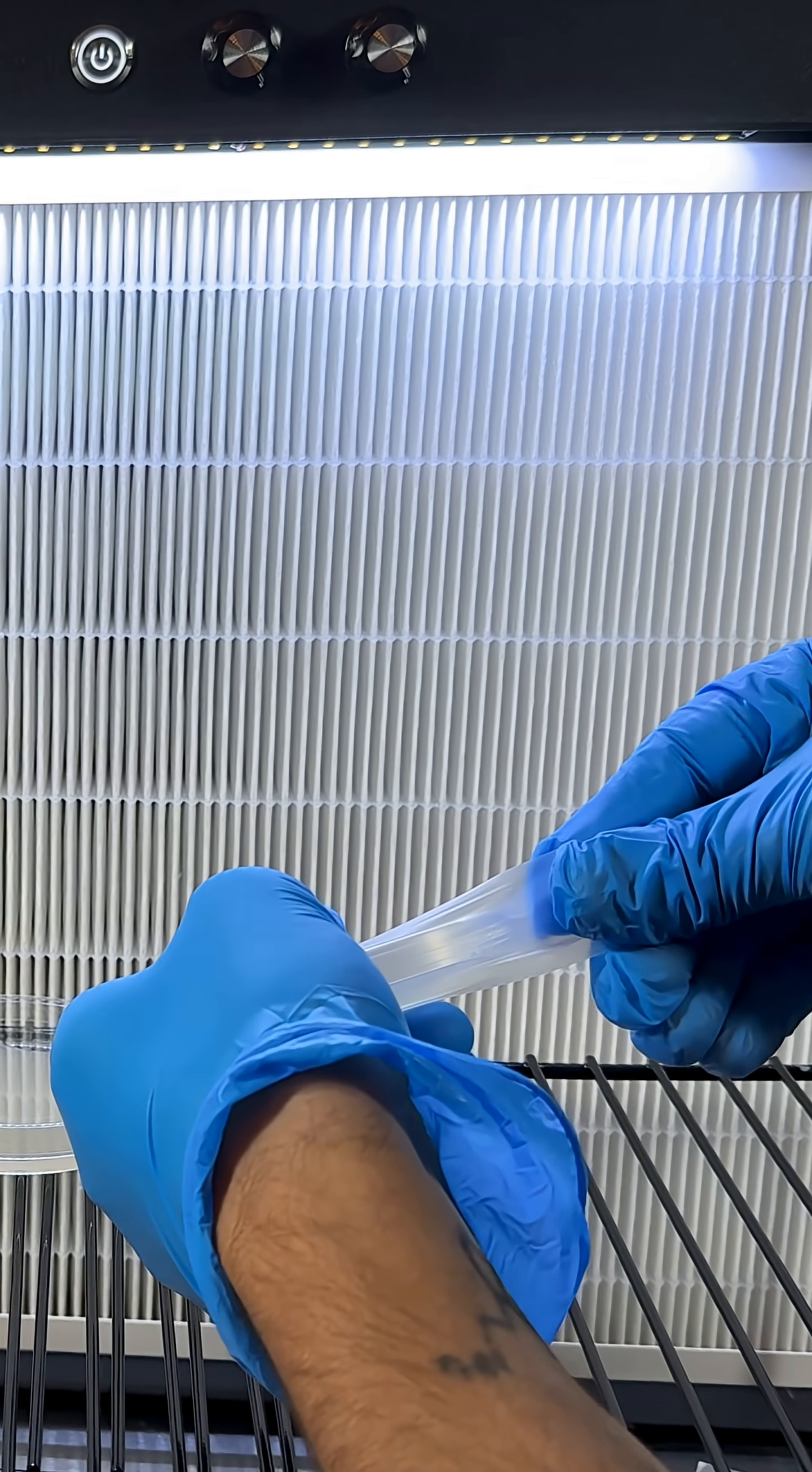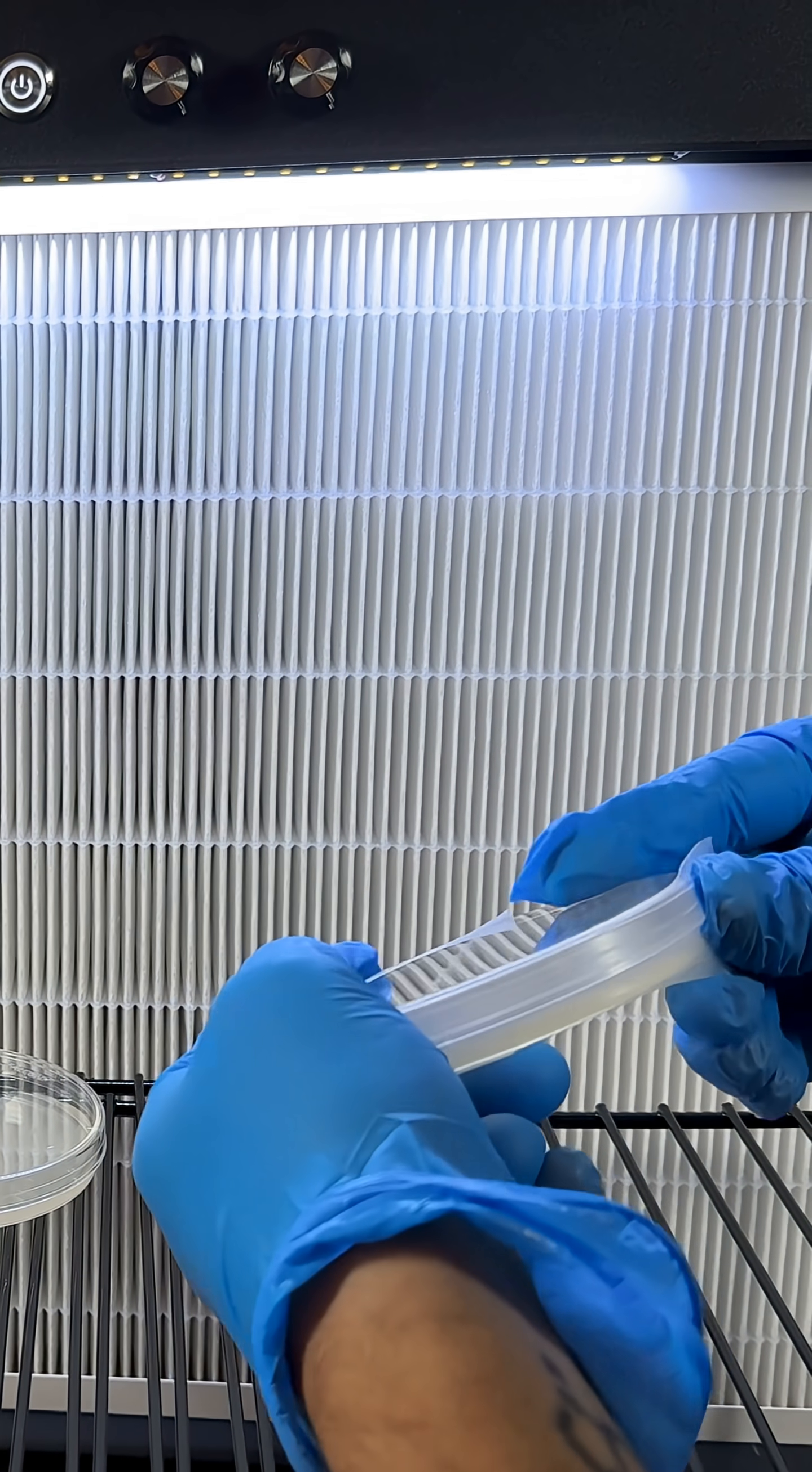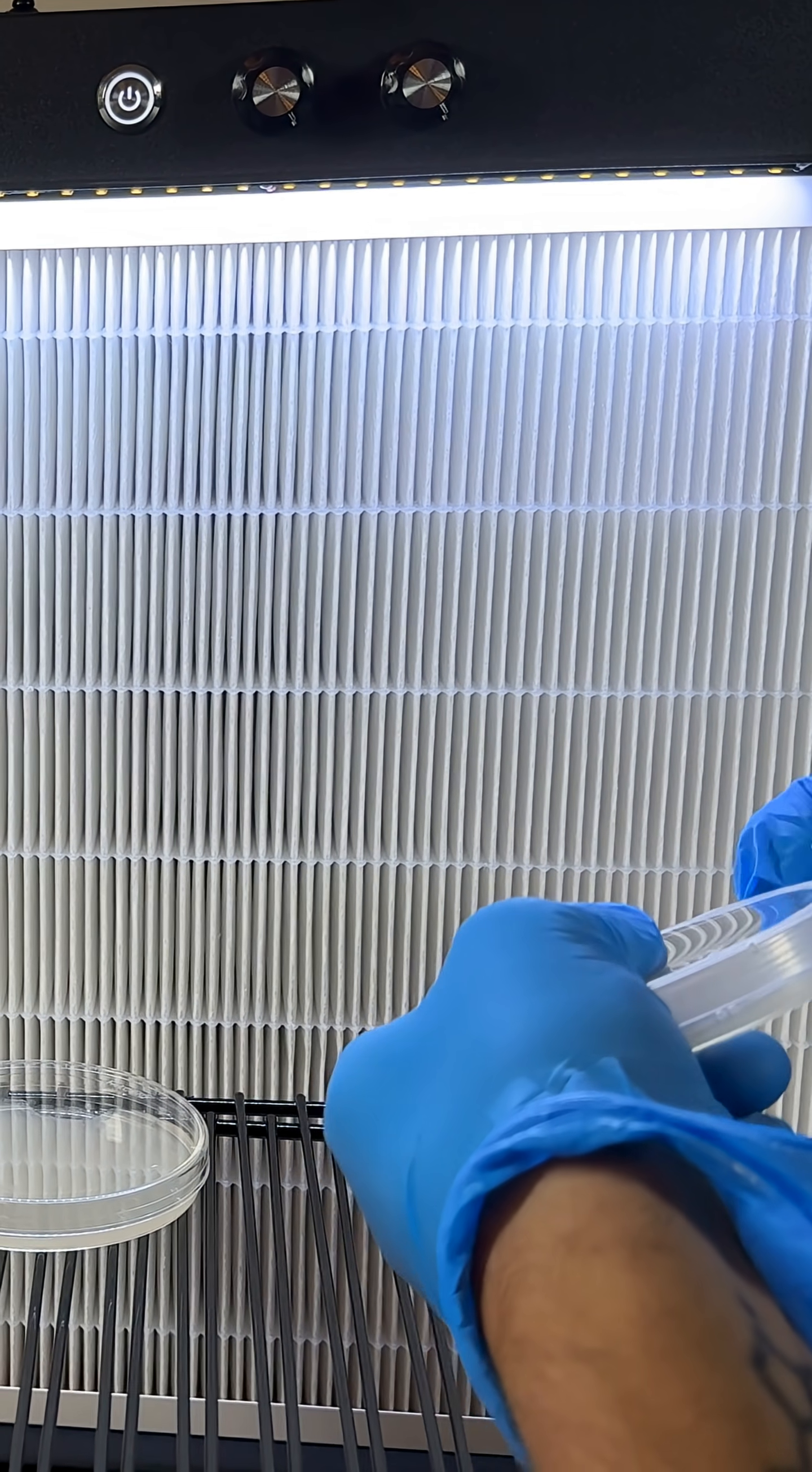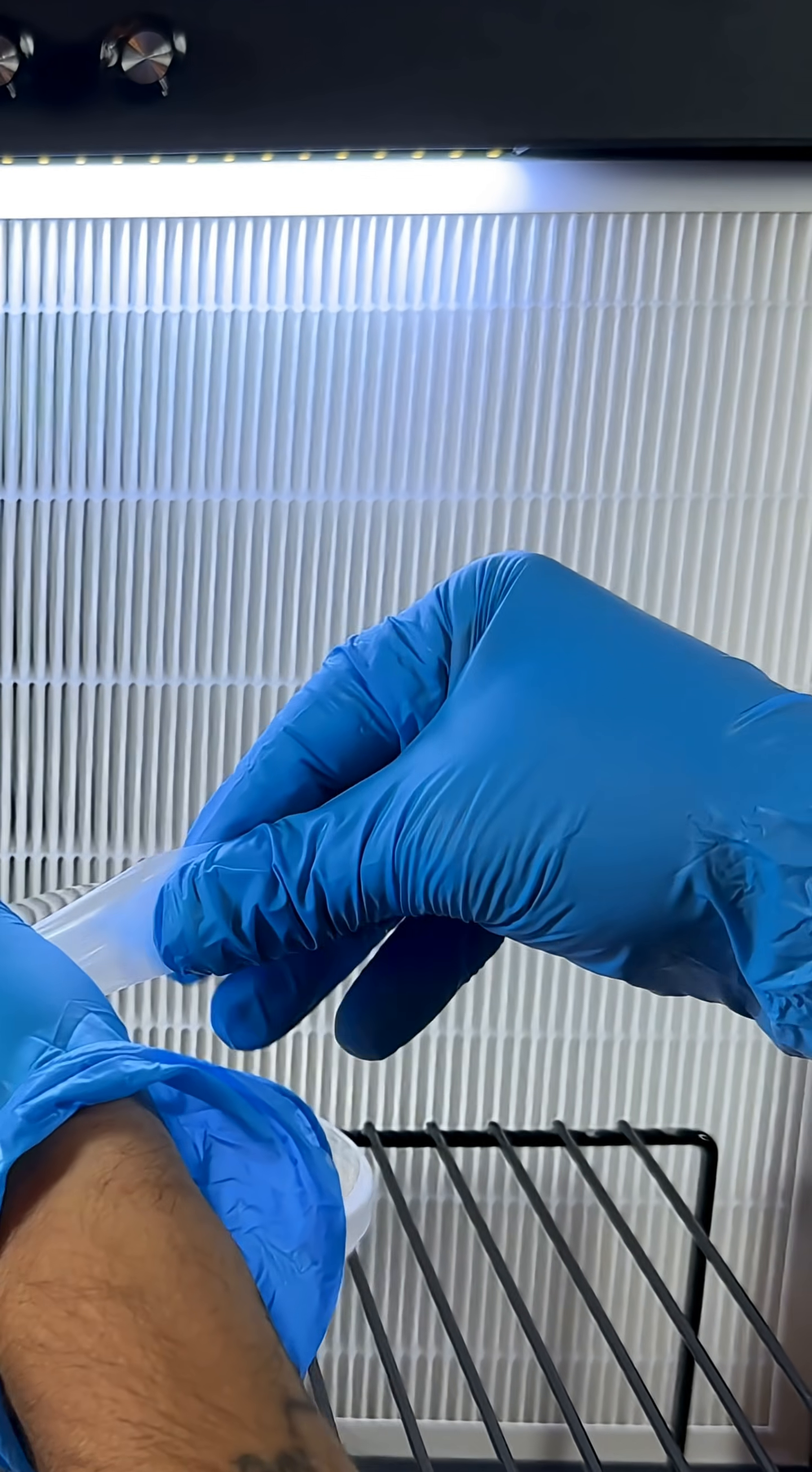I tested the unit's efficiency by exposing open agar plates to the laminar flow for 20 minutes. After the 20 minutes I resealed the agar plates and then set them on a shelf in a warm room that's around 75 degrees Fahrenheit for 14 days to see if any contamination shows up on the agar plates.